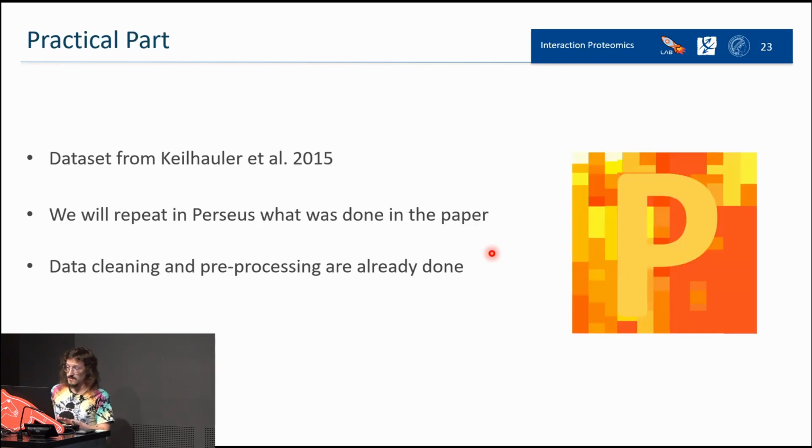So now is the time for the practical part. As I said, we will use the data set from this paper, and every step that has been done in this paper will be reproduced in Perseus. There are not so many steps, actually; it is a very simple and linear workflow.